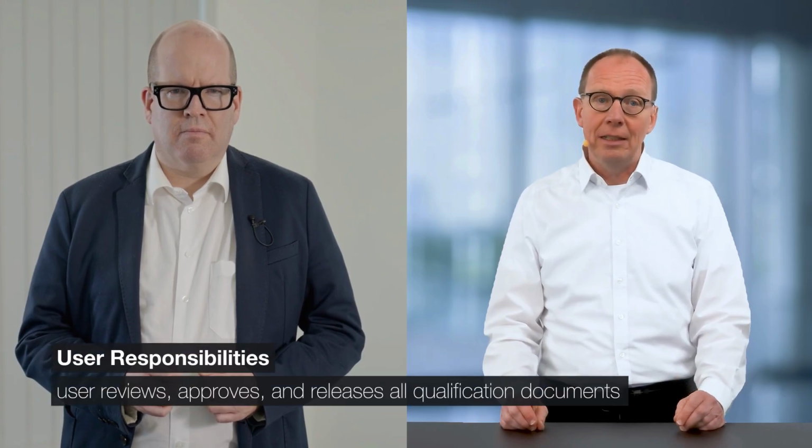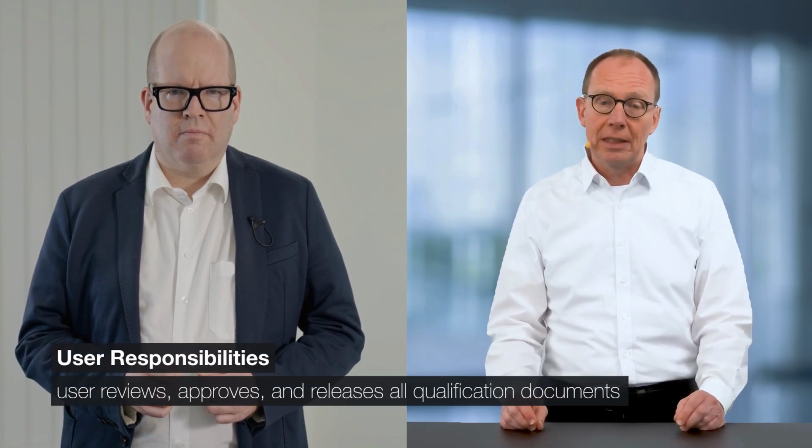And Axel, what responsibilities does the instrument user have in the qualification process? The ultimate responsibility of the entire qualification process stays with the instrument user. This means the instrument user must release all qualification documents and finally approve the filled-in documents by signing them. Georg?